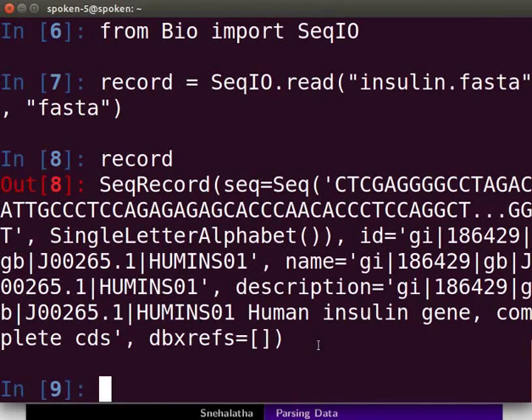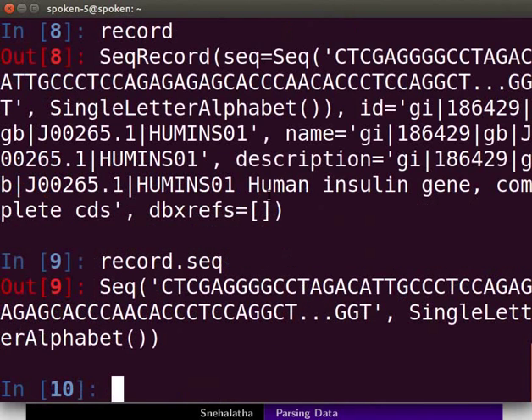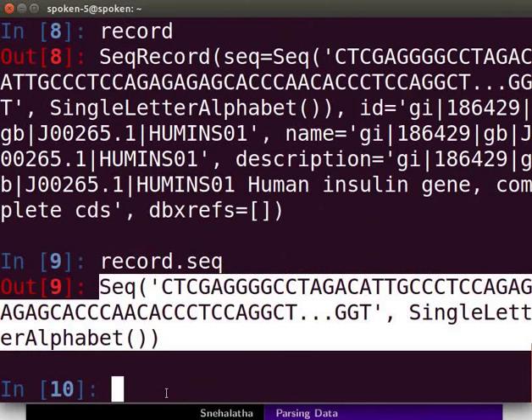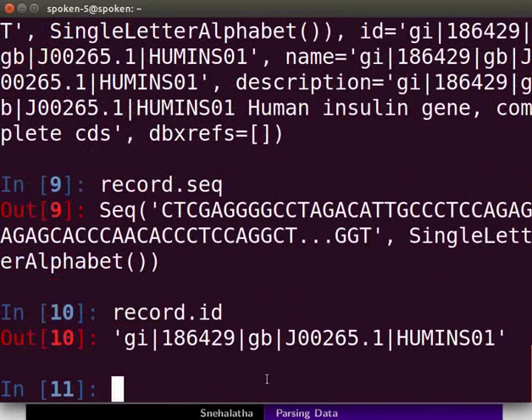We can also view individual attributes of this record. At the prompt, type 'record.seq' and press Enter. The output shows the sequence present in the file. To view the identifiers for this record, type 'record.id' and press Enter. The output shows the GI number, accession number, etc. You can use the functions described above to parse the data files of your choice.